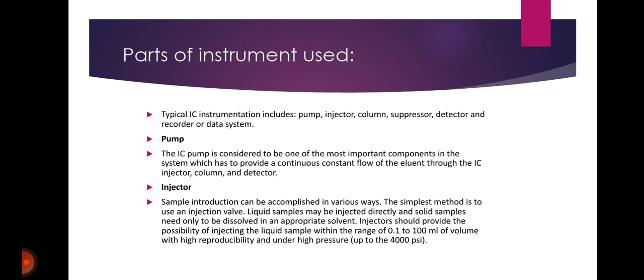Now, parts of the instrument used in ion exchange chromatography. First, the pump. The IC pump is considered to be one of the most important components in the system, which has to provide a continuous constant flow of the eluent through the ion exchange chromatography injector, column and detector.